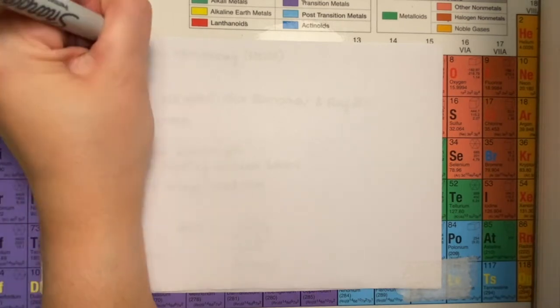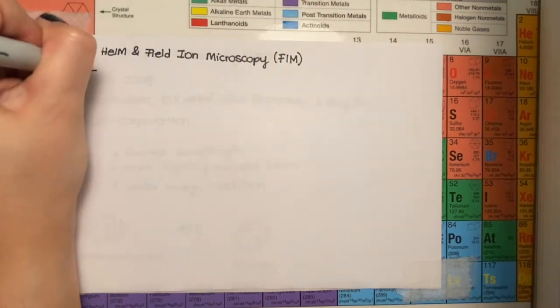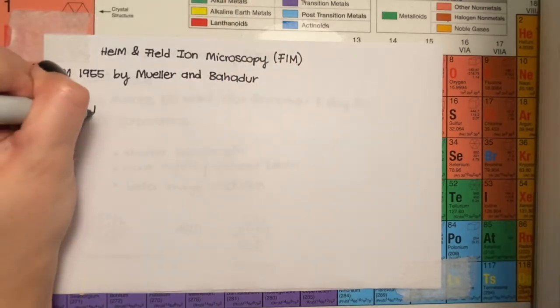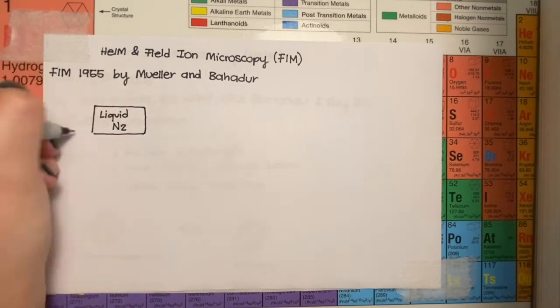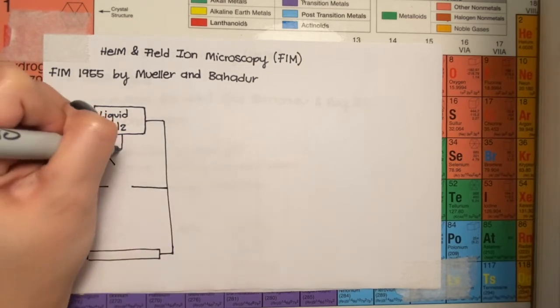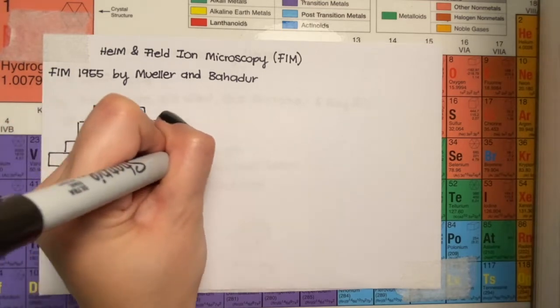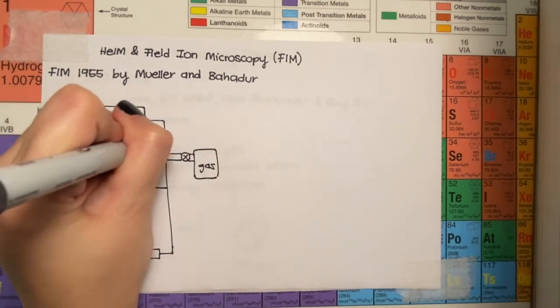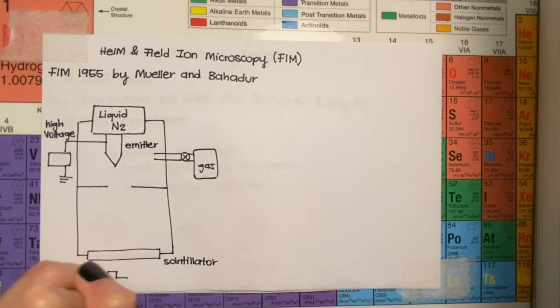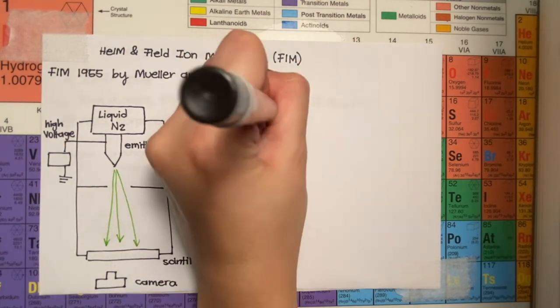Helium microscopy is related to field ion microscopy, or FIM, a technology developed in 1955 by Müller and Bahadur to look at individual atoms on a cryogenically cooled tungsten tip in ultra-high vacuum with small amounts of helium gas in it. In the 1980s, scientists created a focused ion beam microscope with a gallium ion source. However, they were not able to capture the best images using this heavy ion, which inspired others to pursue other ion sources. Helium ion microscopy is similar to the gallium technique, but as mentioned before, it has a pyramid-shaped ion source that forms a focused beam.